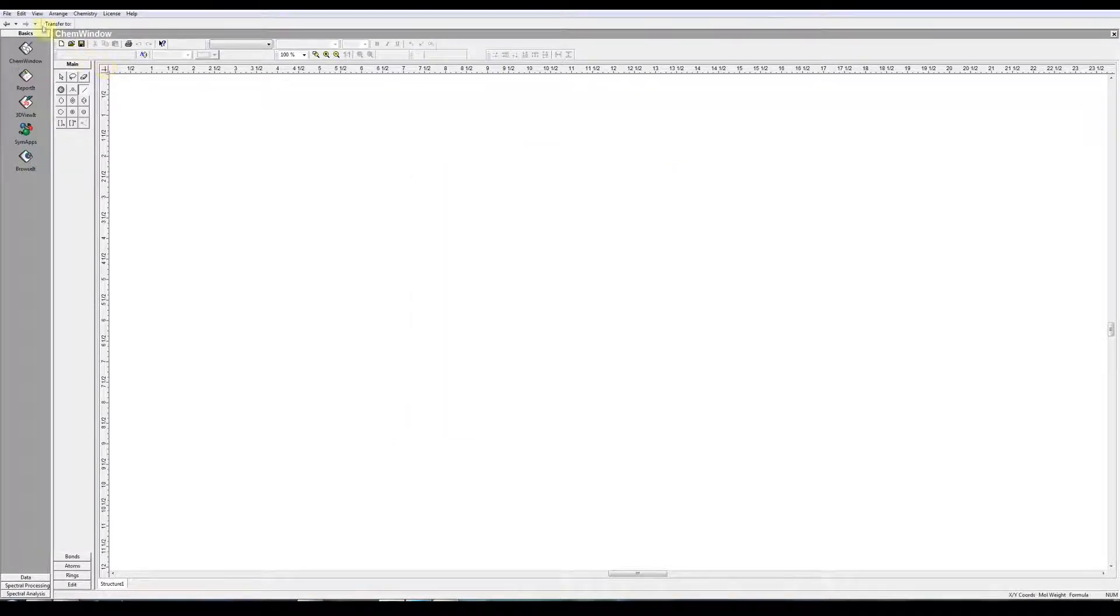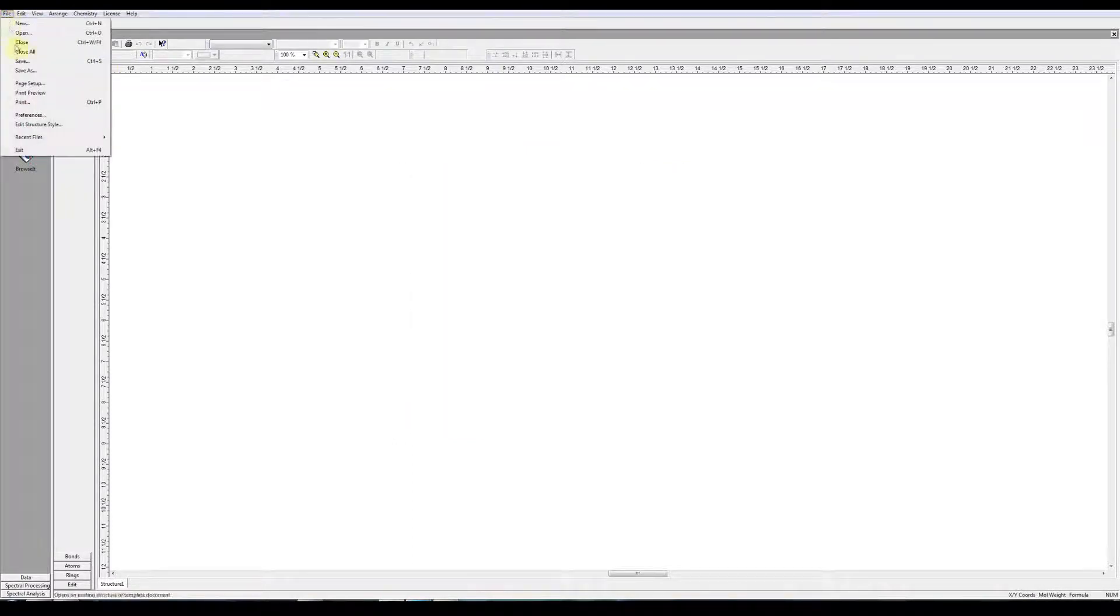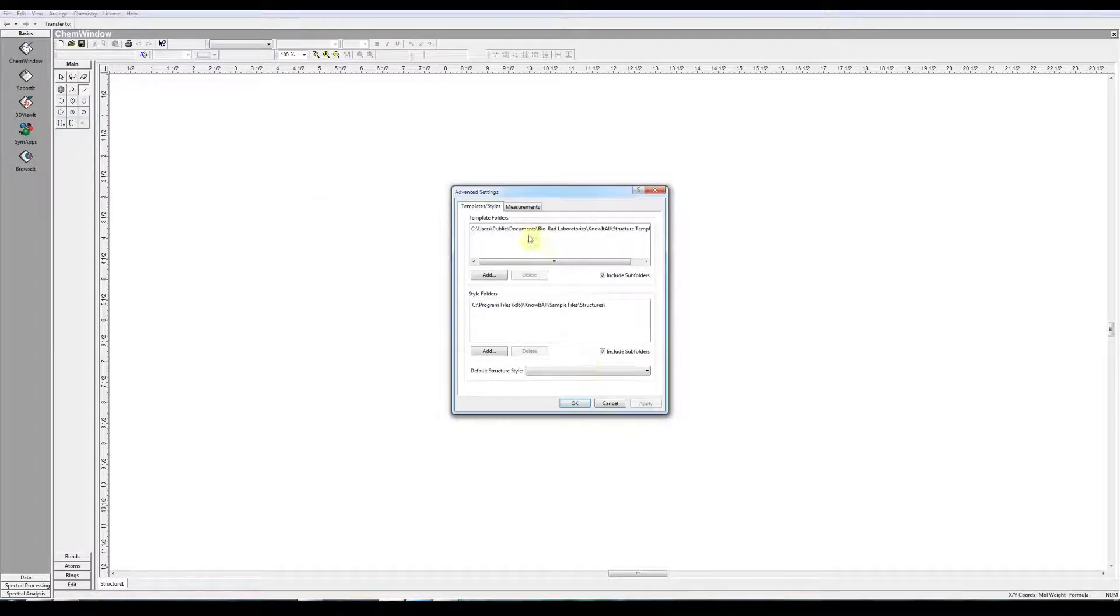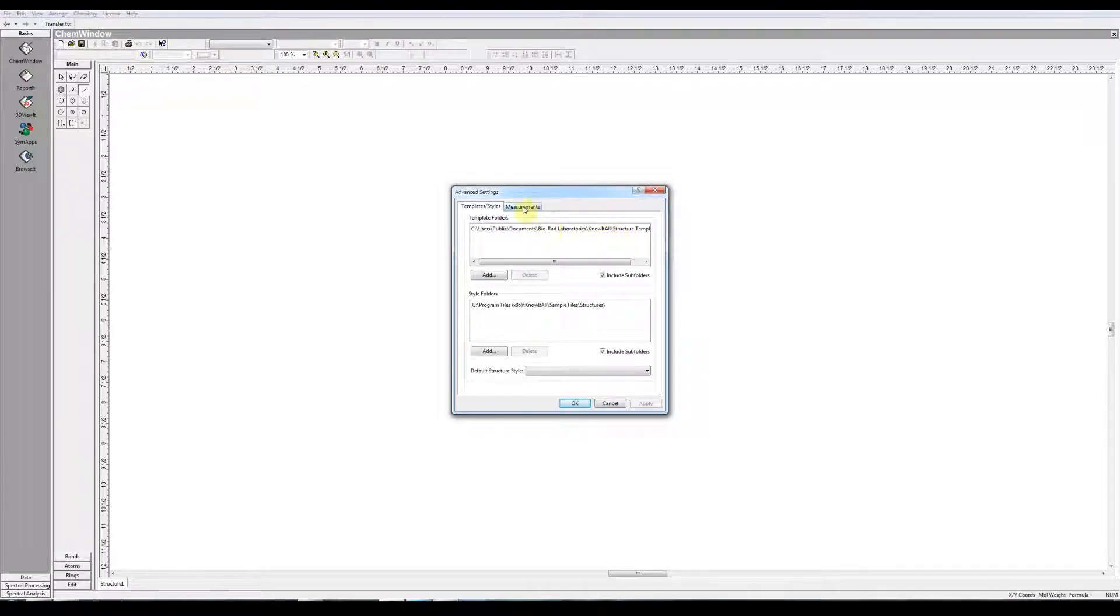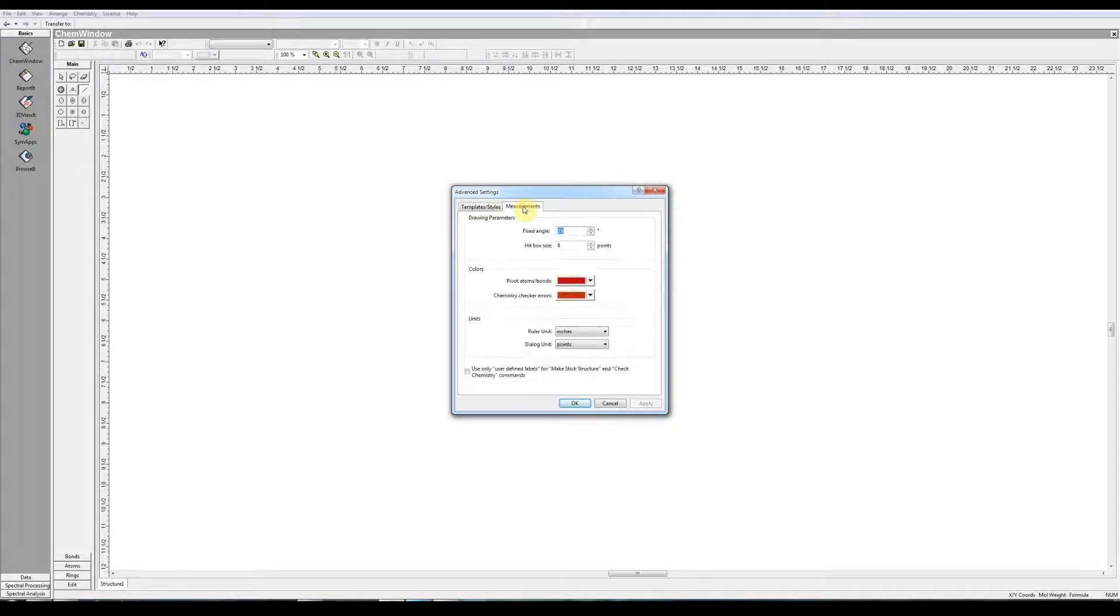If you choose File, Preferences, we have under Templates and Styles, we have the location where the files are saved.